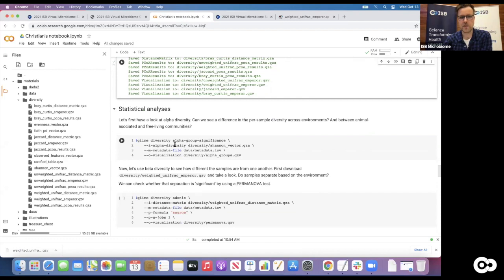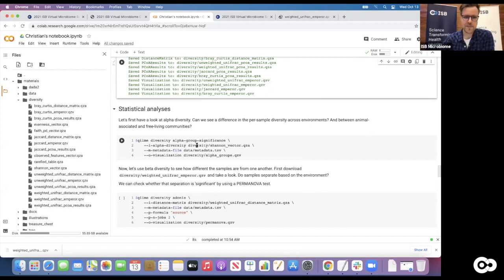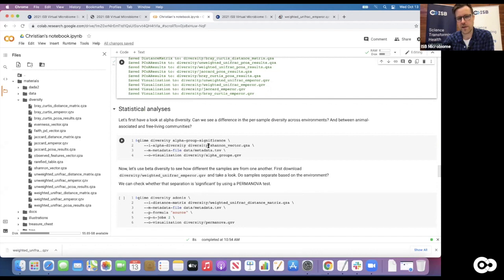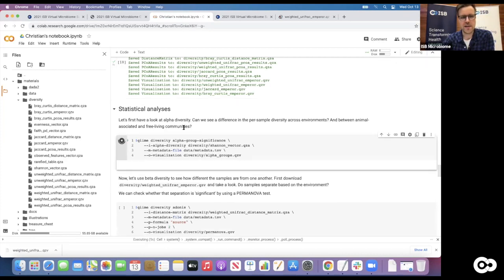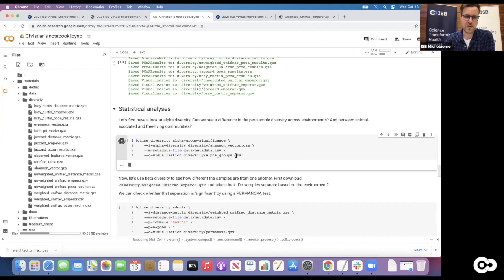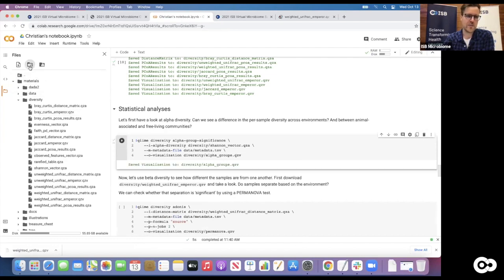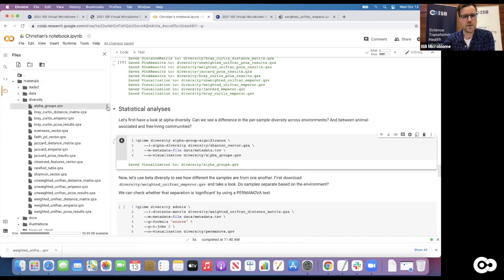We want to look at whether certain environments have higher ecological diversity than others. We can do that with the diversity plugin using the alpha group significance test, which runs a significance test for different groups. We use the Shannon index as our diversity metric, we use our metadata file to compare groups, and we save it as a visualization called 'alpha_groups'. Running it will generate the output file alpha_groups.qzv in the diversity folder, which we can download.